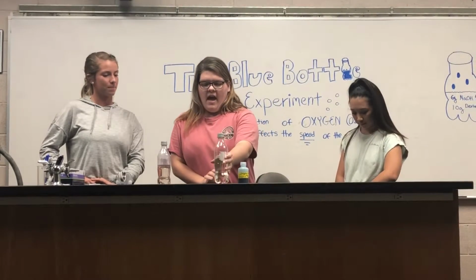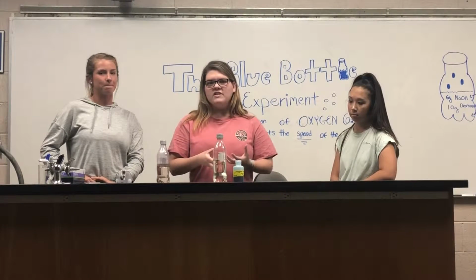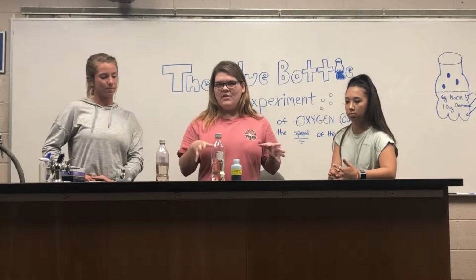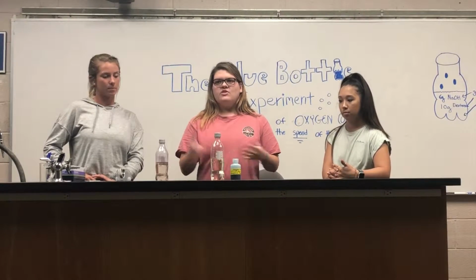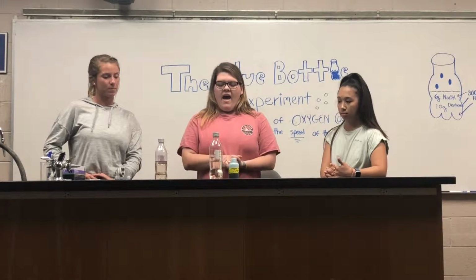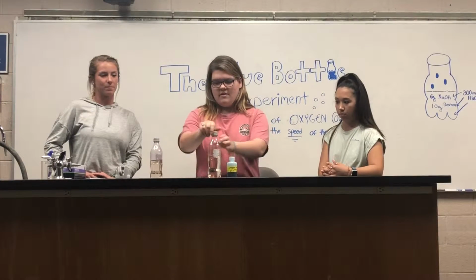water. And when we add the methylene blue, it will start to fade over time, and that's because in these alkaline conditions, which is caused by the sodium hydroxide, the glucose will start to change the oxidation state of the methylene blue, and it goes clear. And once you shake the bottle up again, it goes blue.